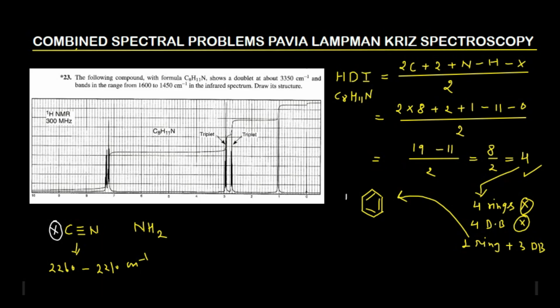So now you have two fragments. The first fragment is the benzene ring, and the second fragment is the NH2 group, right? So this is the most probable. In a little while, we will also confirm why this NH2 is there. Some other information is also there.